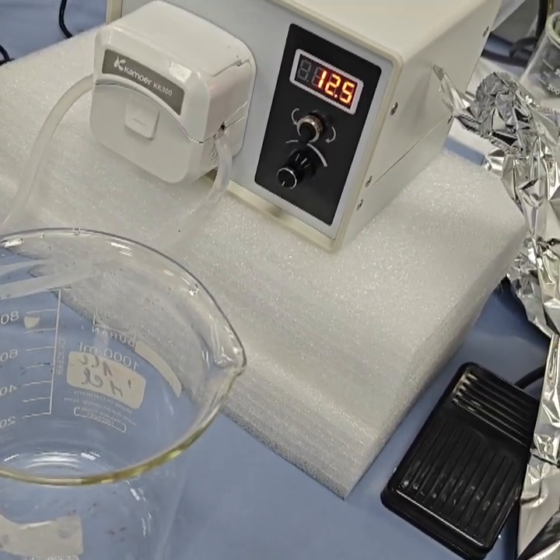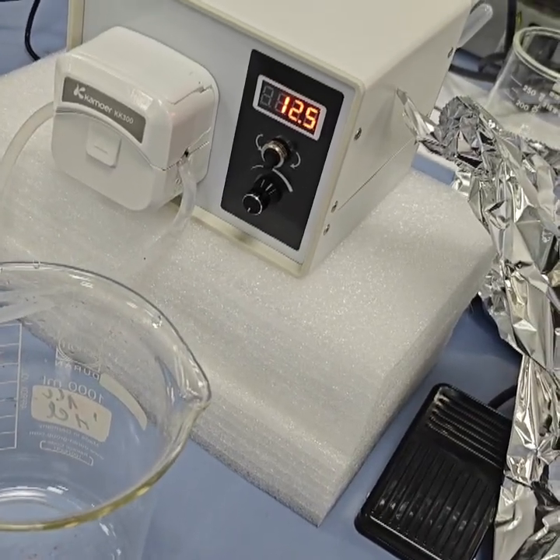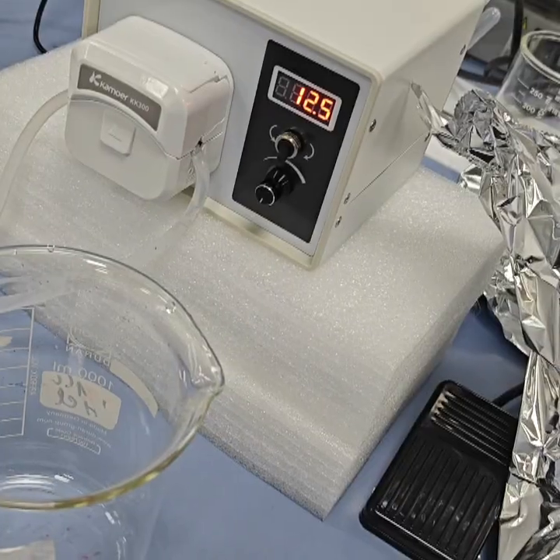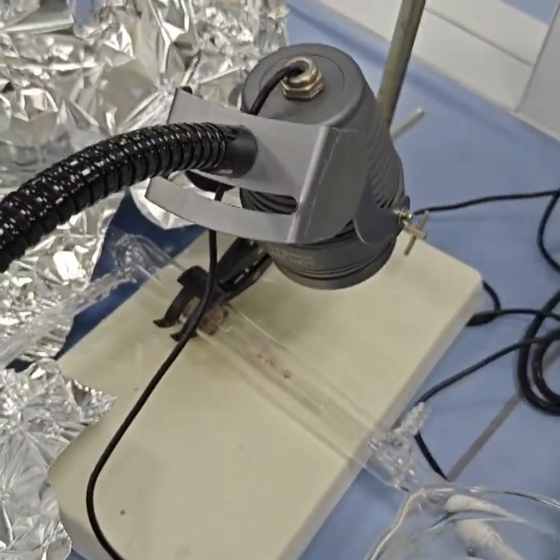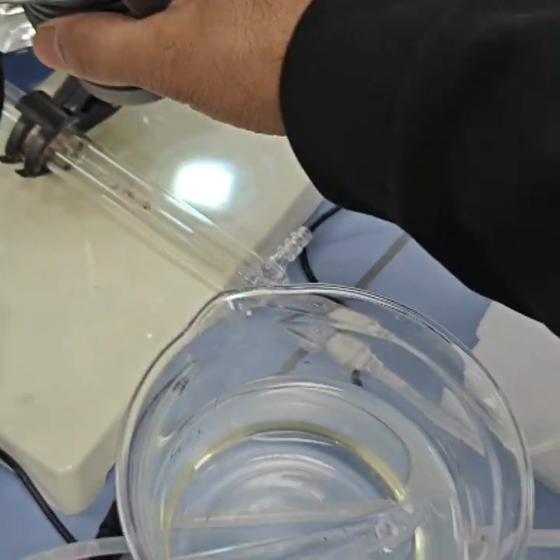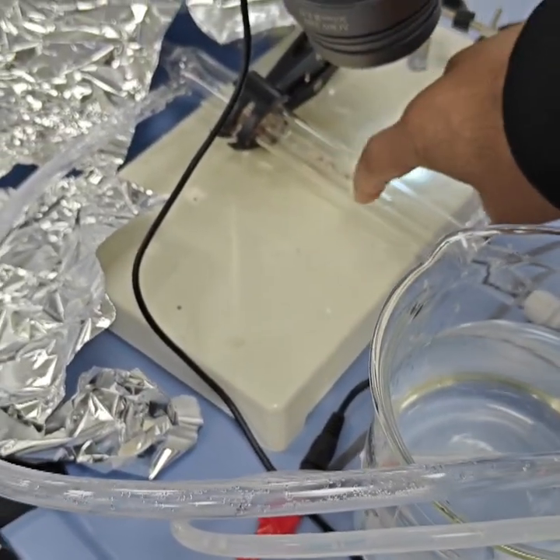This is the central part, the heart of the system. Depending on my trial, it can be a packed bed reactor with biochar or an LDH membrane. I have also mounted this UV. If I switch on the UV, it would be directly concentrated on the area where I have put my membrane.